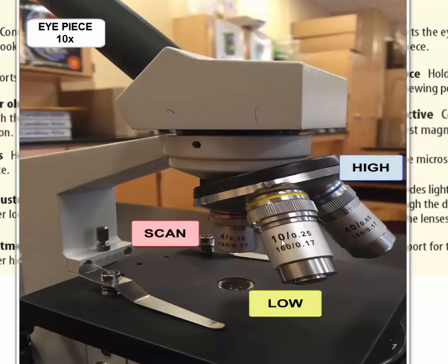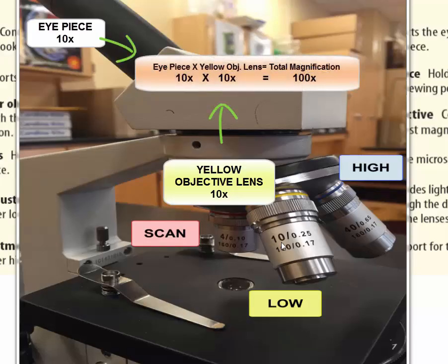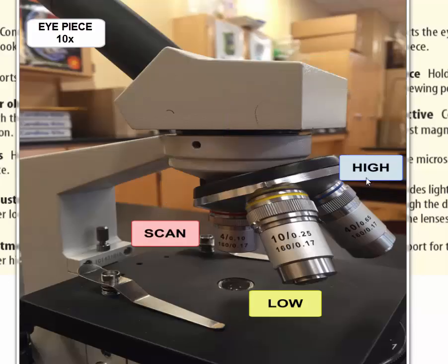The low power lens, the yellow one, has a 10 here. So when we switch on to this that's going to give us a total magnification of 100 power. 10 power for the lens and then 10 power for the eyepiece. And then lastly we have the high power lens.